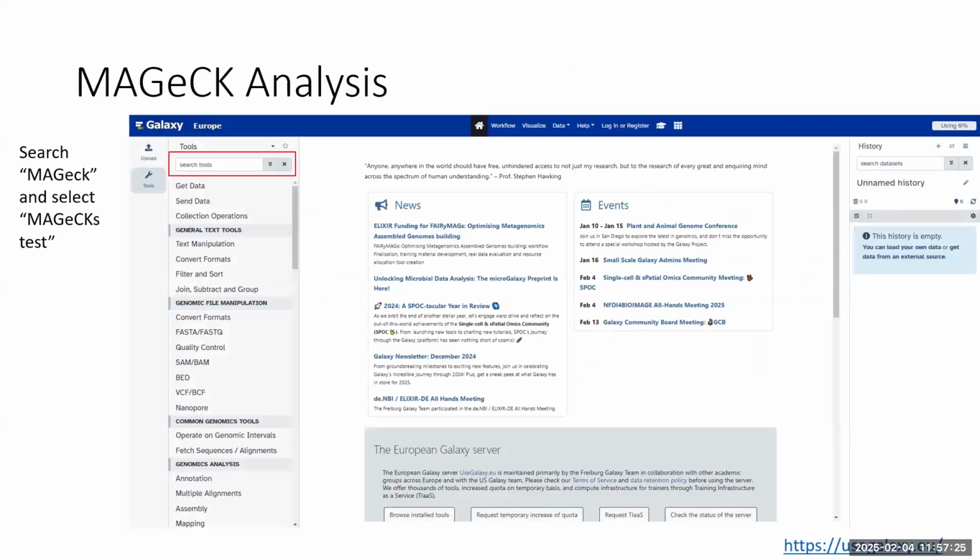Okay, and so then we get on to the MAGeCK analysis. So we've got the Excel file that has all the copy numbers of your guides. What you want to do is figure out a statistical analysis that will tell you, because you've got 4 guides per gene in there, so you're not obviously going to look at all 70,000 and eyeball it across and say, all right, which ones are enriched and which ones are not.